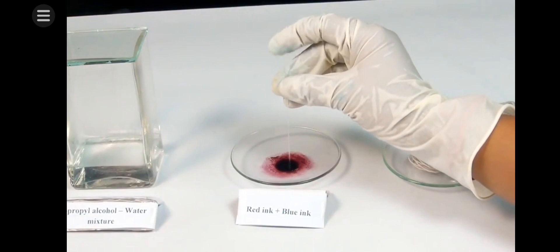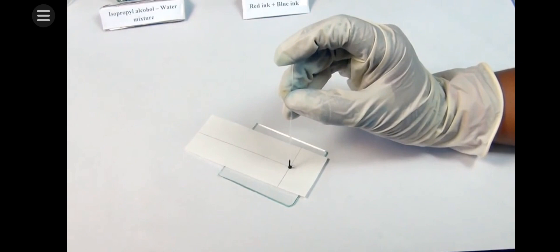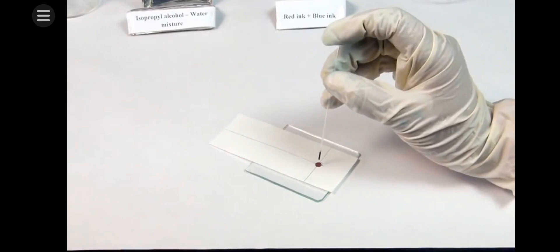Take the mixture of red and blue inks using a capillary tube. Put a drop of mixture of red and blue inks at the point P. Allow it to dry in open air. Put another drop on the same spot and dry again so that the spot is rich with the mixture.